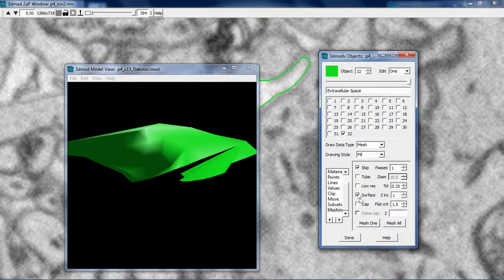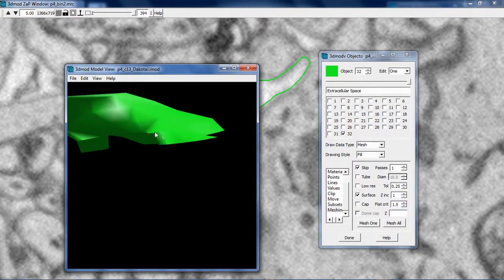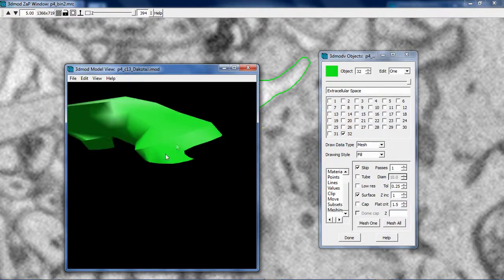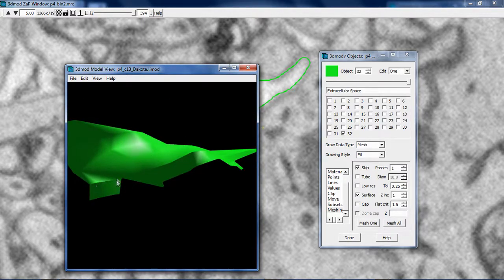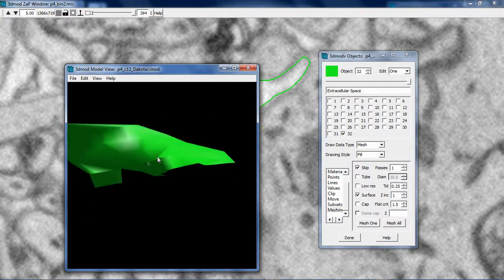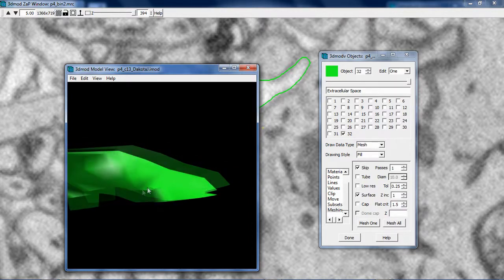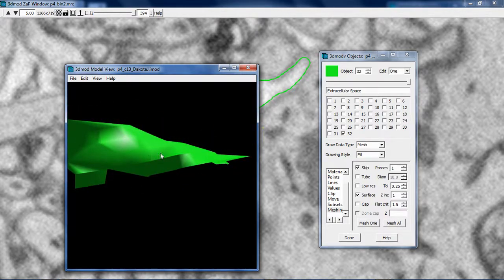Notice we still have surface selected, so it's actually going to be looking at our surfaces in order to create the mesh. And there we go. We have something that looks a little more reasonable. This piece is connected appropriately to the upper contour. This smaller piece is broken off accordingly. So that is how to break into multiple surfaces.